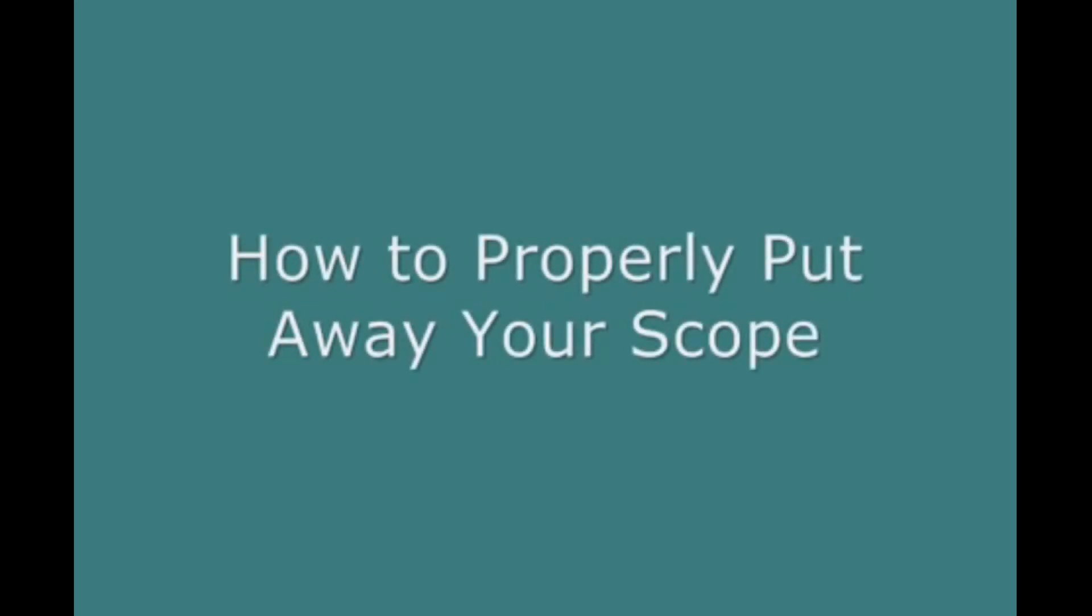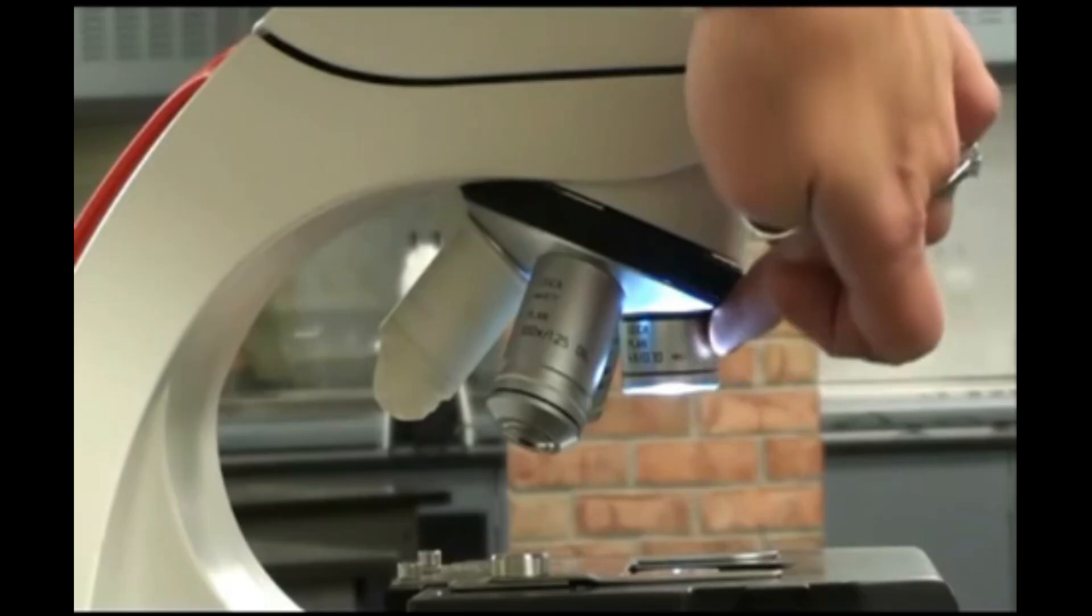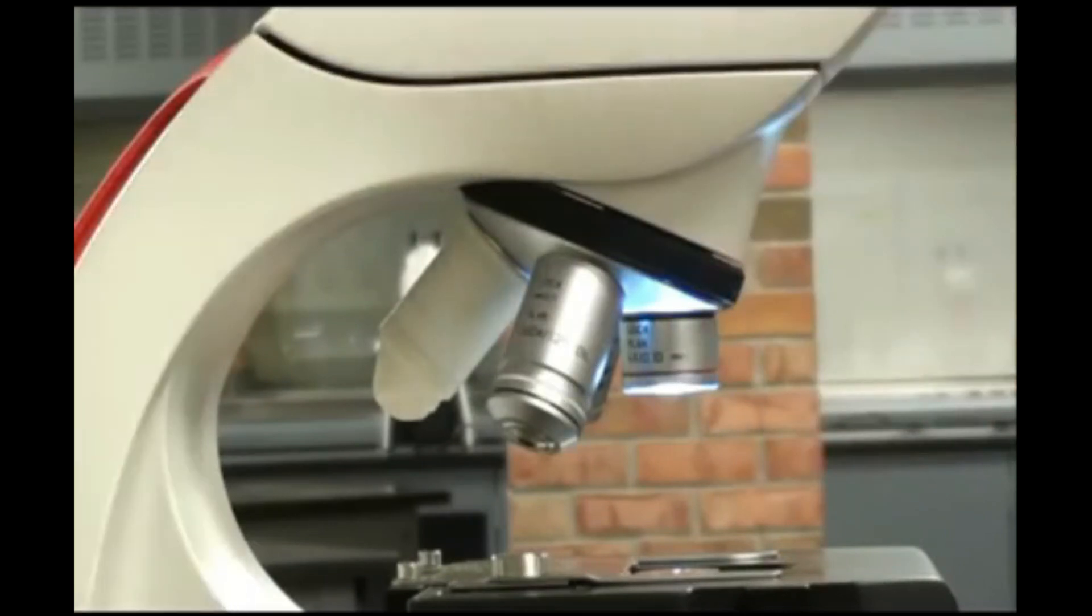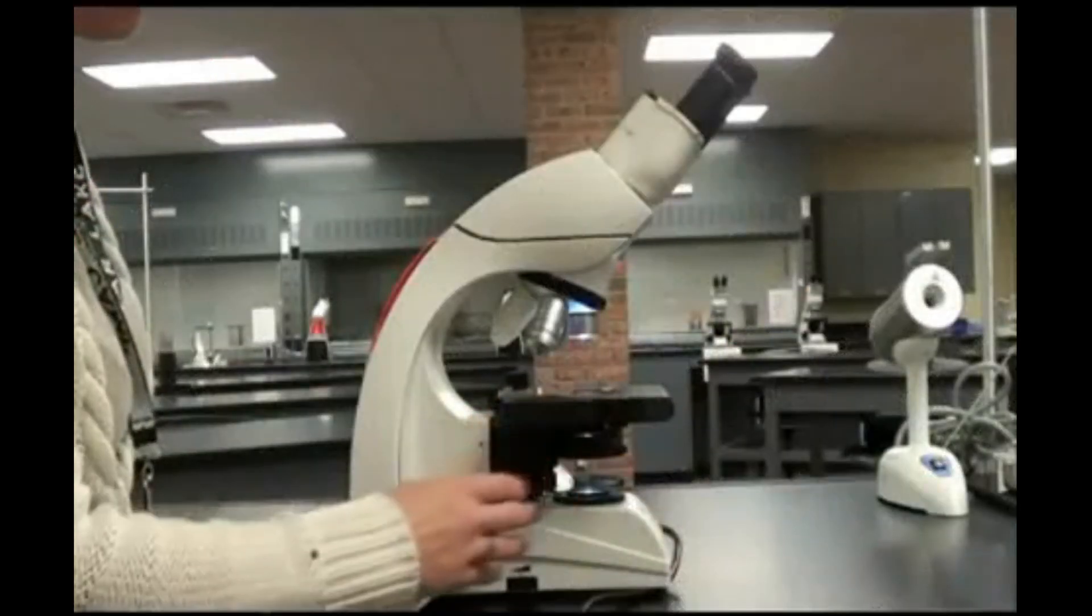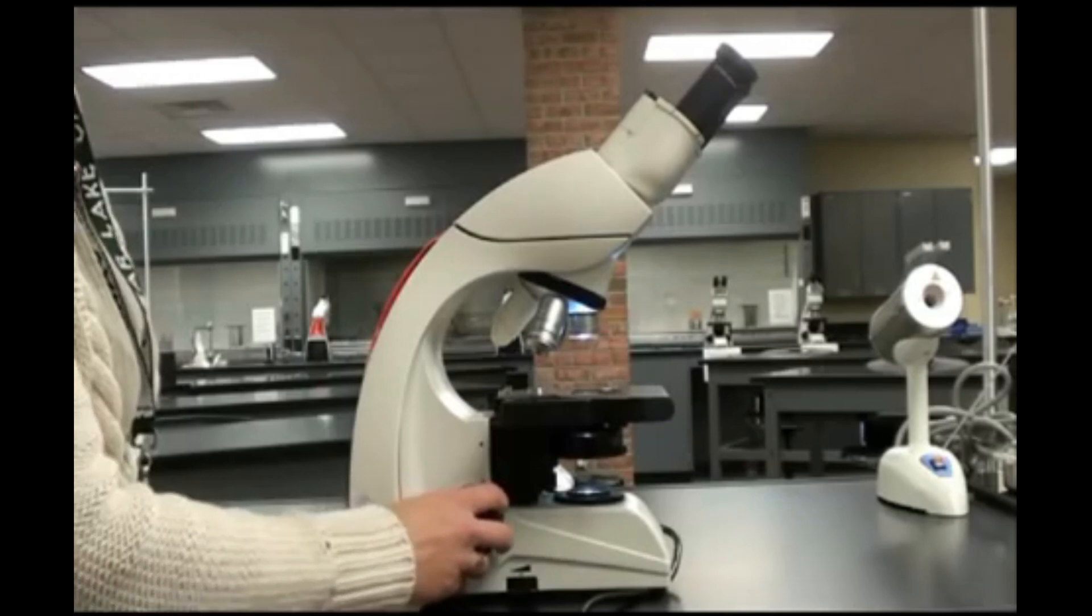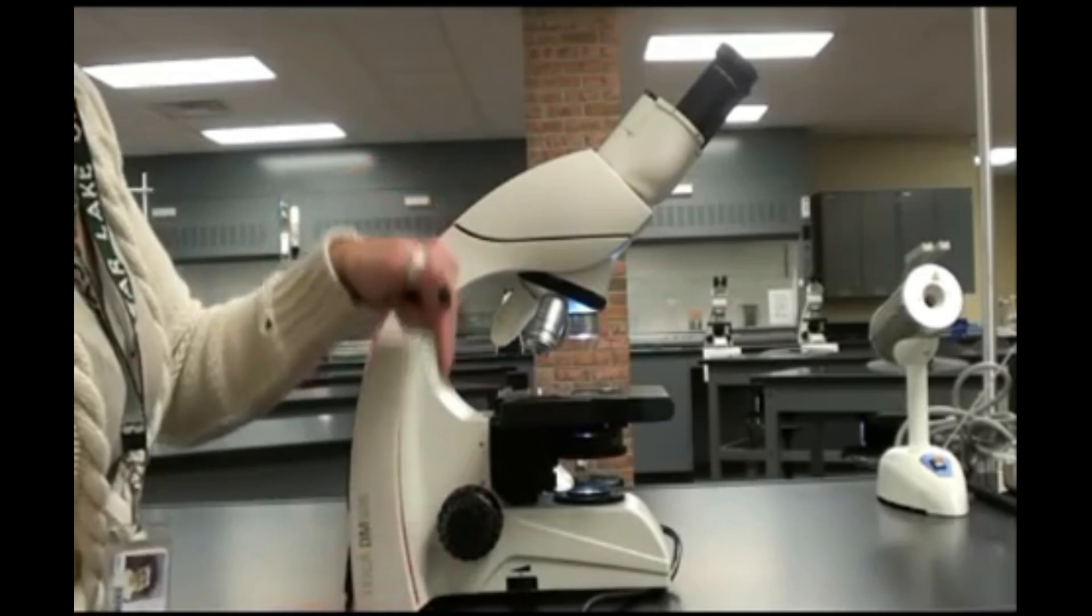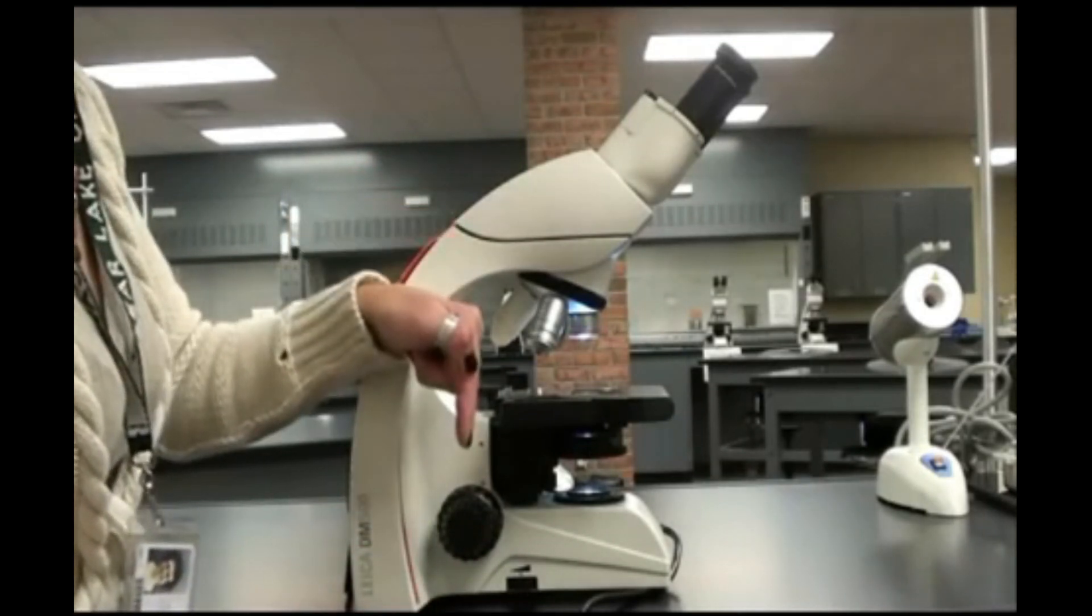When you are all done, it is important to put away your scope properly so that it won't get damaged. You do this by making sure that the shortest objective lens is pointing down, the scanning power. Then you dial the coarse focus down all the way to lower the stage as far as it can go. This way, we know that the lens is not going to smash into the stage.